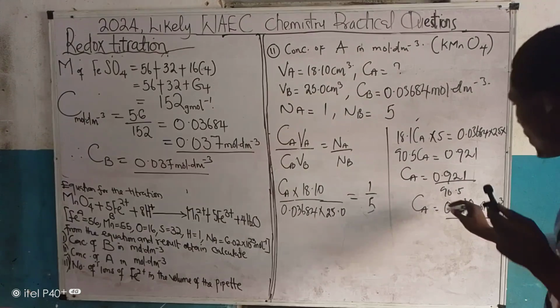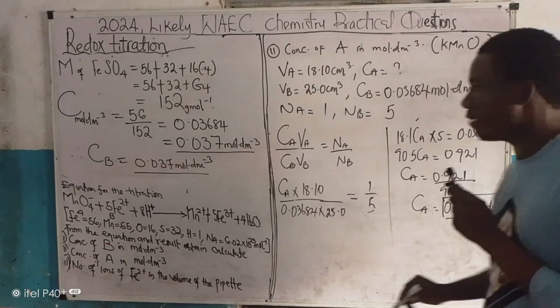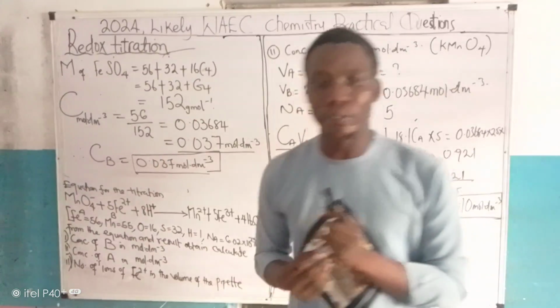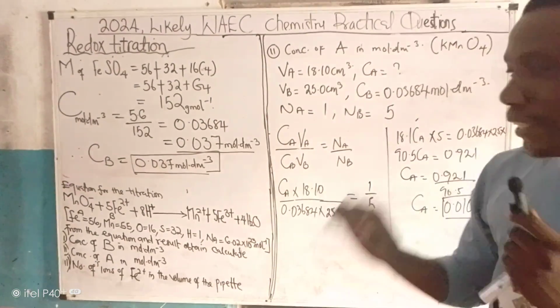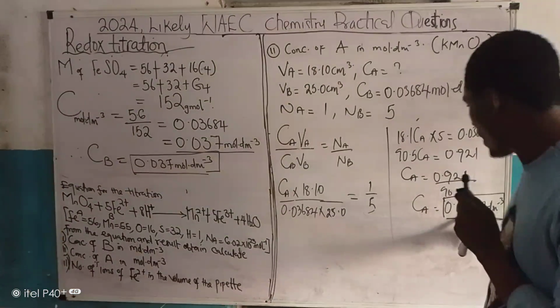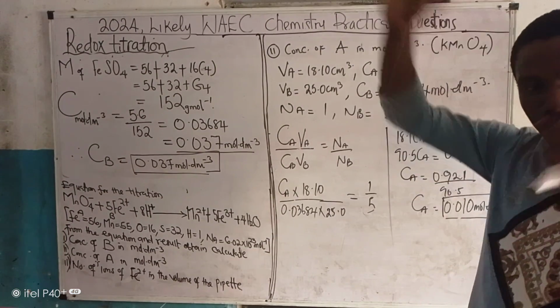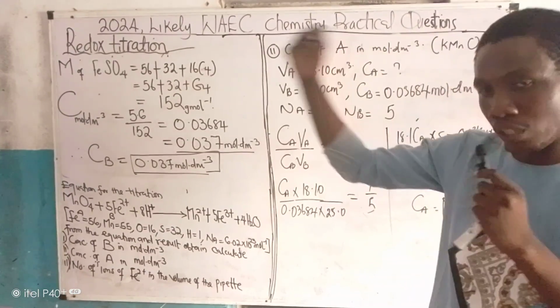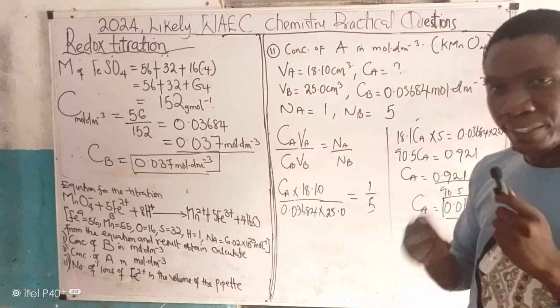Okay? That is to show that you have followed the right procedure in preparing the specimen for the student. So if I have my CA as this and my CB as this, wow, that's interesting that the results I got, the endpoint, is very accurate. That's why I discovered that my CA and my CB still fall within the parameters of what the specimen was describing. That's quite interesting.